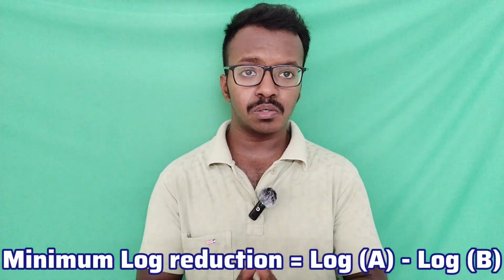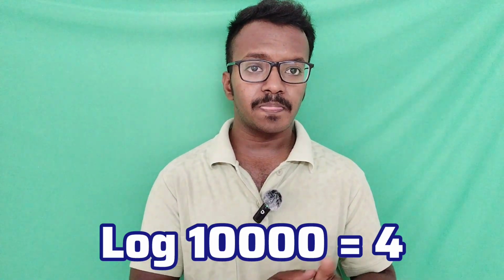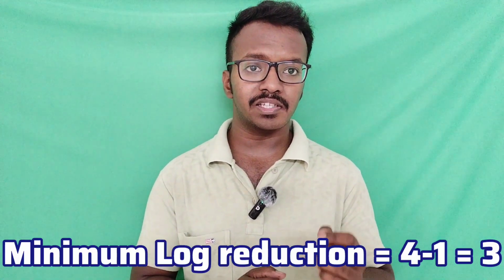And the other formula, minimum log reduction, is equal to log A minus log B, meaning log 10,000 minus log 10. Log 10,000 is equal to 4, log 10 is equal to 1. So 4 minus 1 is 3. Finally, we got the required log reduction of 3. The endotoxin challenge study meets the challenge requirement.